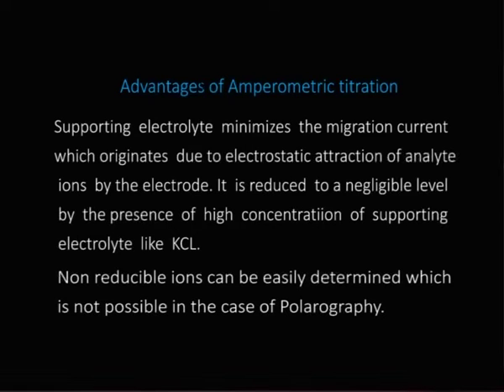Next, non-reducible ions can be easily determined, which is not possible in the case of polarography. In polarography, we require groups which are reducible because we get an S-shaped curve only for the reduction of groups.